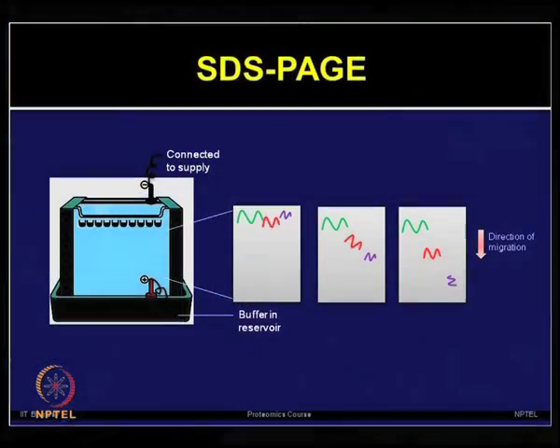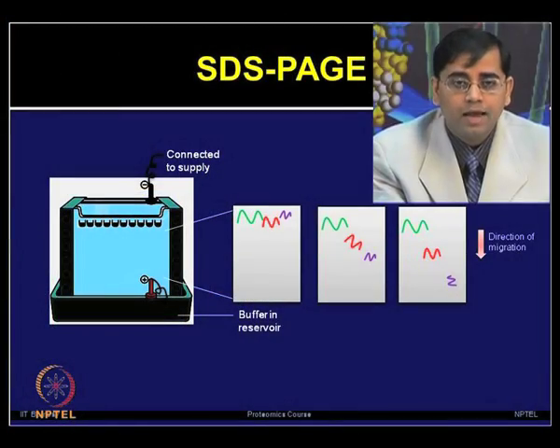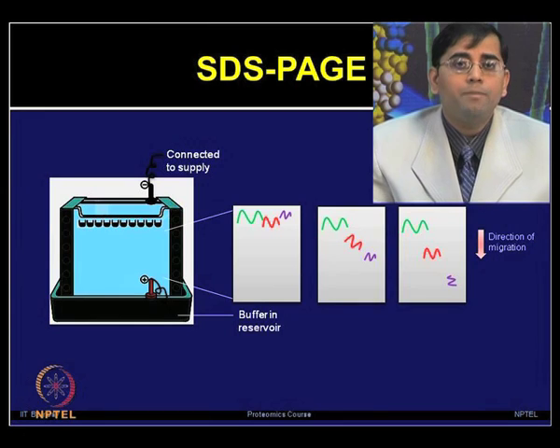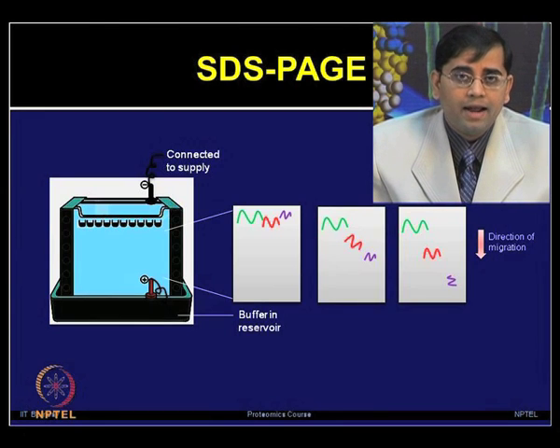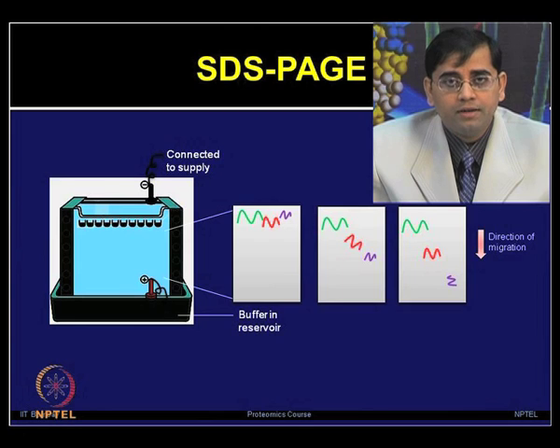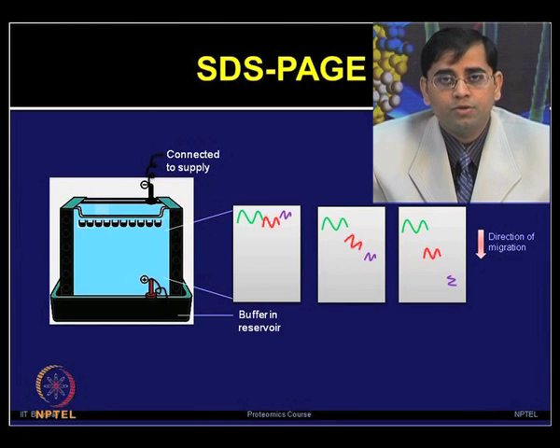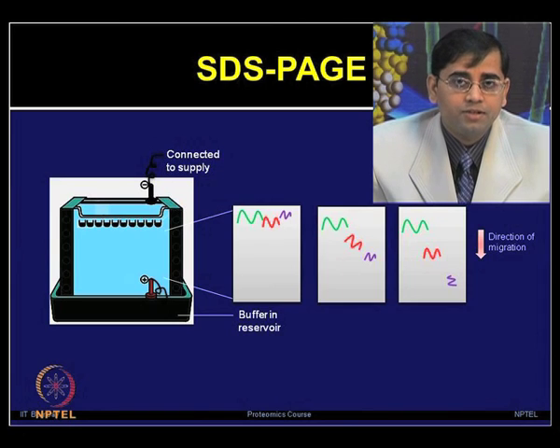Once this protein preparation is done, then you can load this protein on the SDS-PAGE gel, and based on the molecular weight, the lower size proteins will migrate the furthest and the higher molecular weight proteins will remain near the top surface of the gel. So, depending upon the protein size, you can separate the protein based on the lower and higher molecular weight in this SDS-PAGE gel.